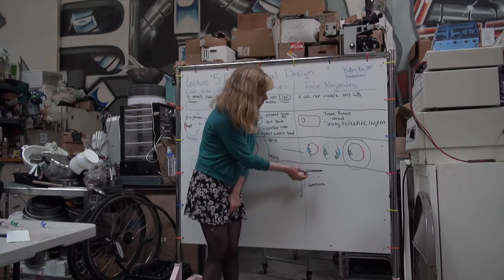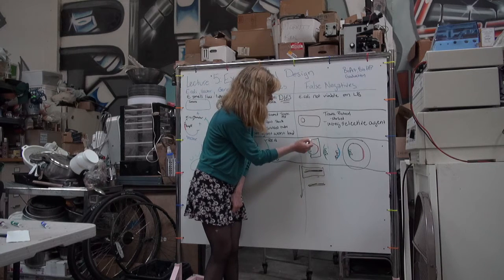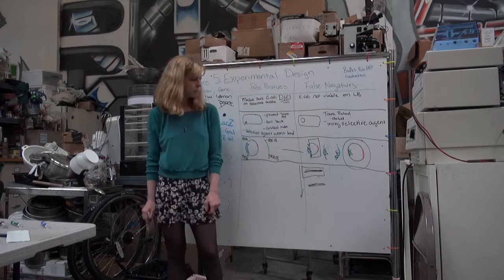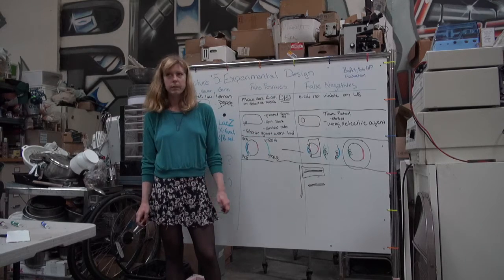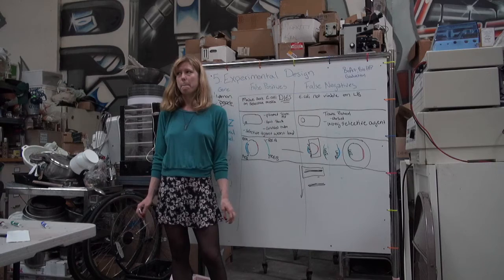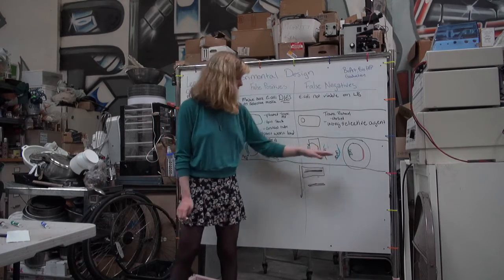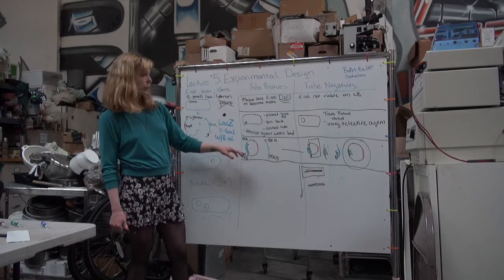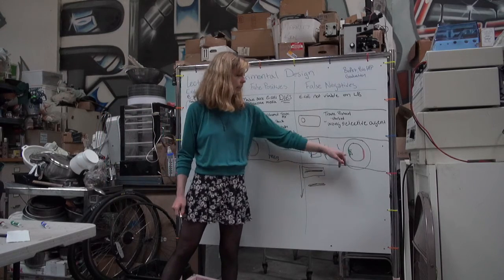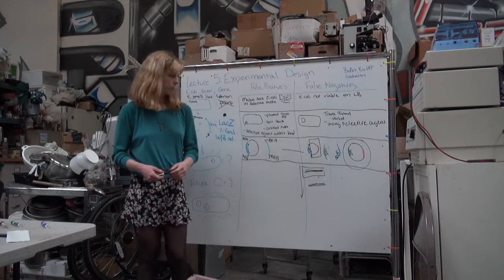And you can cut out this part, right, from the gel and purify it out that way. This can maybe interfere with your later process, so sometimes you have to skip that step. And so that's one of the reasons why we knock out a gene, so that you can know that this piece got into your vector here.